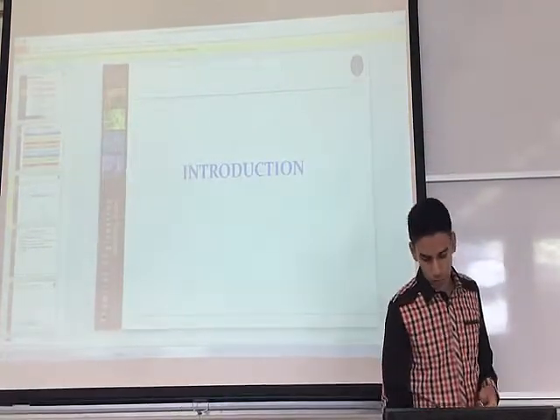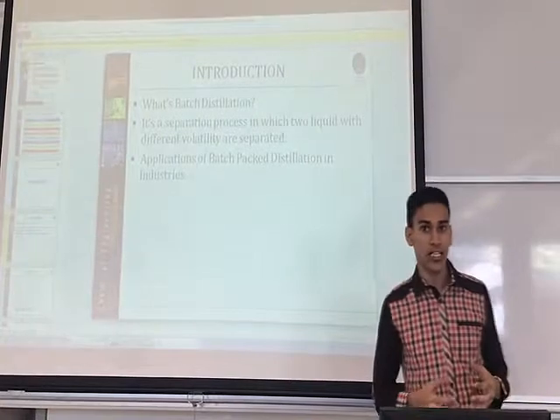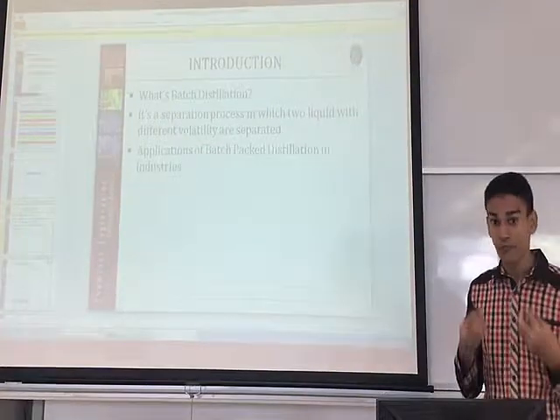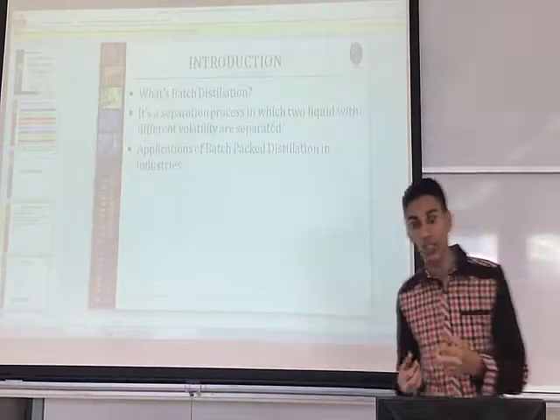So let's start with the introduction. So what is actually the batch distillation? Batch distillation is a process in which two liquids with different boiling points are heated, vaporized, and then cooled to obtain one of them in a higher concentration than the other.